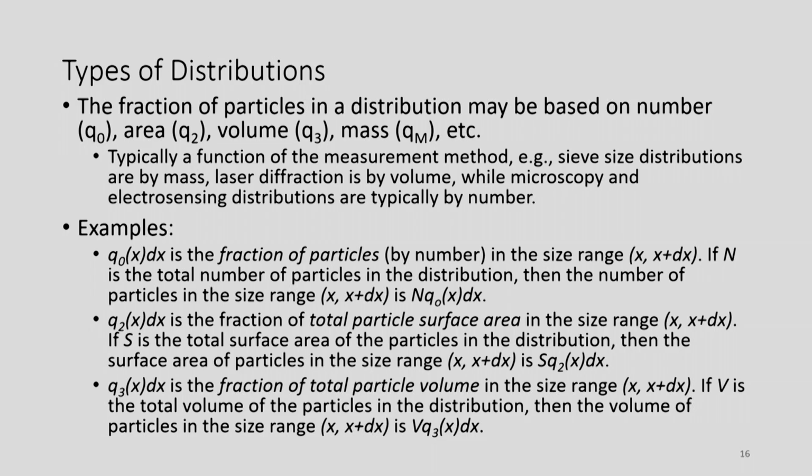But you can calculate shape factors from the particle size calculations that we talked about yesterday. I might have briefly covered it in the shape lecture, but we'll see, the particle shape lecture is next.